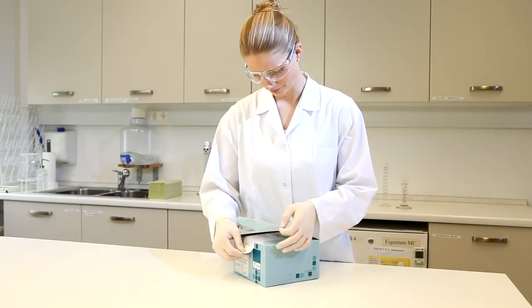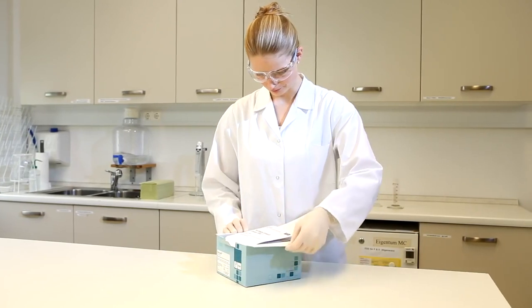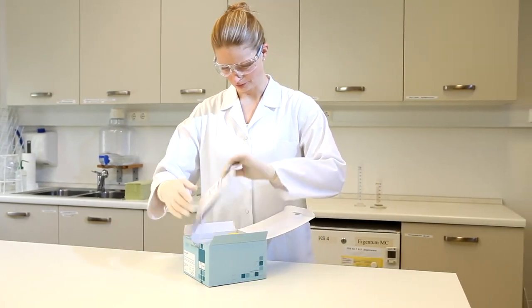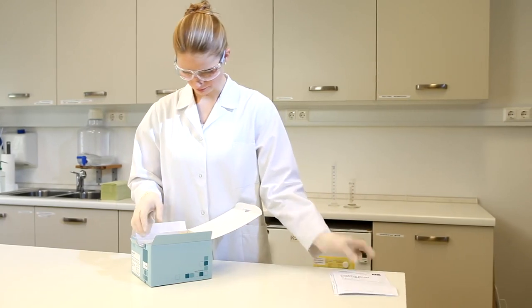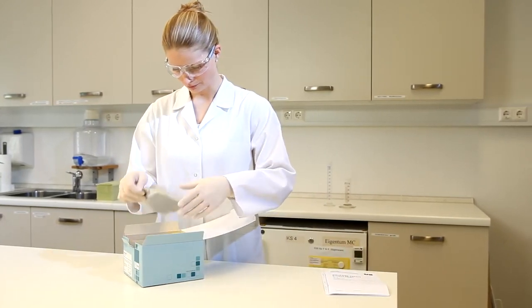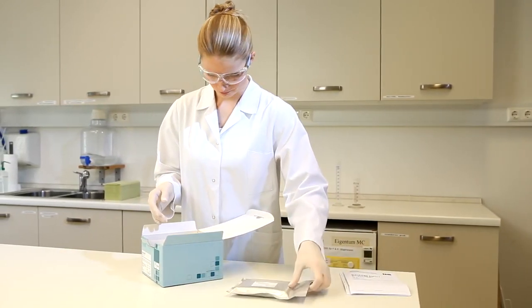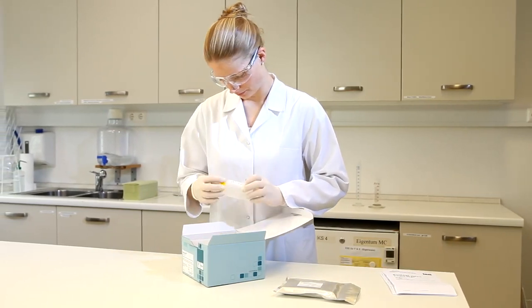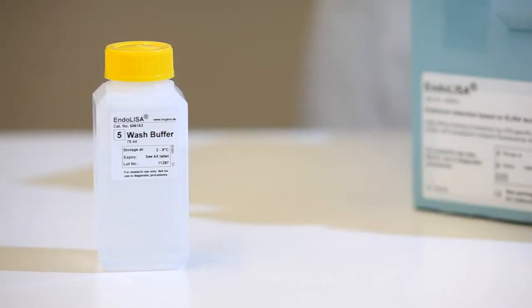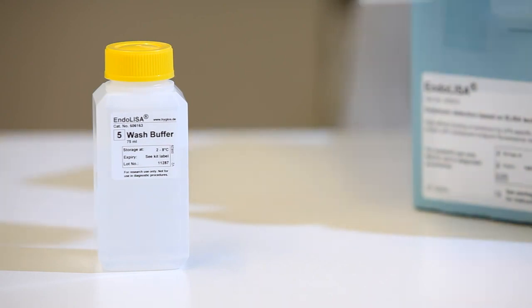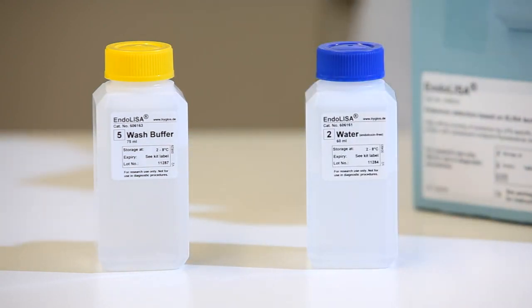Each EndoLISA kit contains reagents for 192 tests. The reagents are: EndoLISA plates precoated with phage binding protein, wash buffer, endotoxin free water, endotoxin standard, assay buffer, enzyme recombinant factor C, substrate, binding buffer, and cover foils.